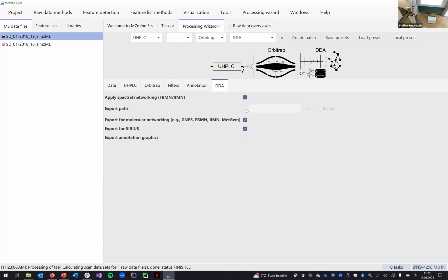Switching polarity, yeah. You can process the data with MZmine, but I would say it's a more advanced approach to processing, because for that you have to do some manual steps, or some manual parameter adjustment in between. I can show you how it works, or we can just talk in the break about how to do that. But I think in the setting here, we would just confuse a lot of people. But yeah, you can do that. You can also process polarity switching data.